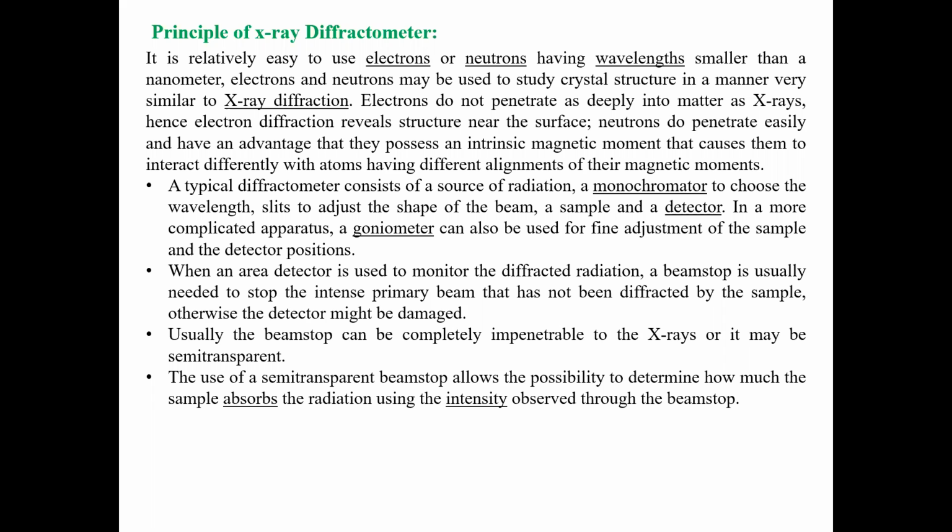Okay, the use of this semi-transparent beam stop allows the possibility to determine how much the sample has absorbed. जे किती सॅम्पल्स ते ऍब्सॉर्ब करते रेडिएशन्स, ते आपले इन्फॉर्मेशन आपल्याला सेमी ट्रान्सपरंट बीम स्टॉप जर यूज केला असेल तर आपल्याला ती मिळते. सो दॅट रेडिएशन्स युझिंग द इंटेन्सिटी ऑब्झर्व थ्रू द बीम स्टॉप. म्हणजे काय इंटेन्सिटी असेल, किती रेडिएशन्स त्याने ऍब्सॉर्ब केले, हे केव्हा आपल्याला माहित पडतं जर सेमी ट्रान्सपरंट बीम स्टॉप आपण यूज केला असेल एक्सरे डिफ्रॅक्टोमीटरमध्ये.